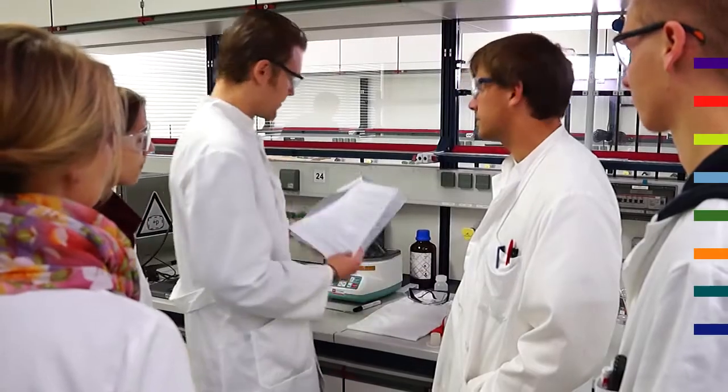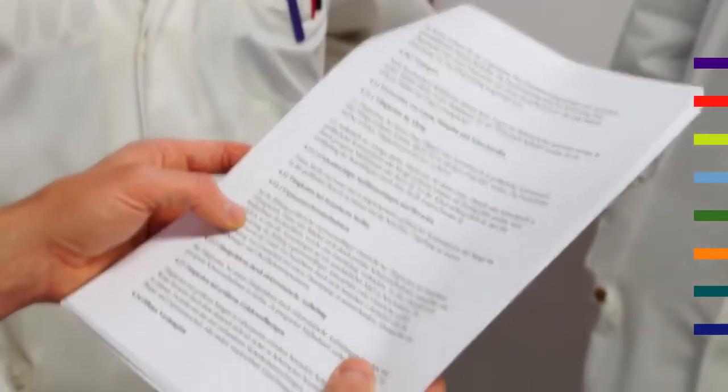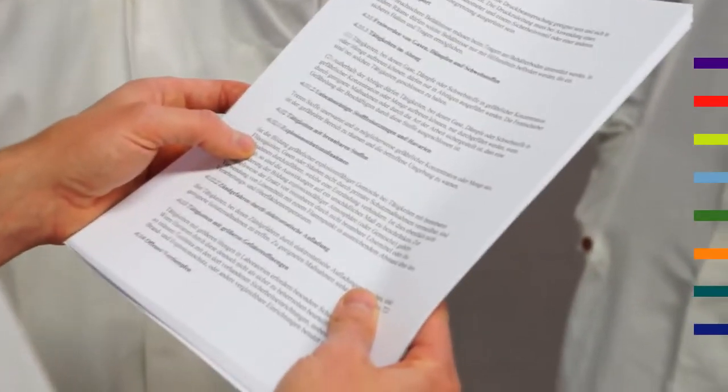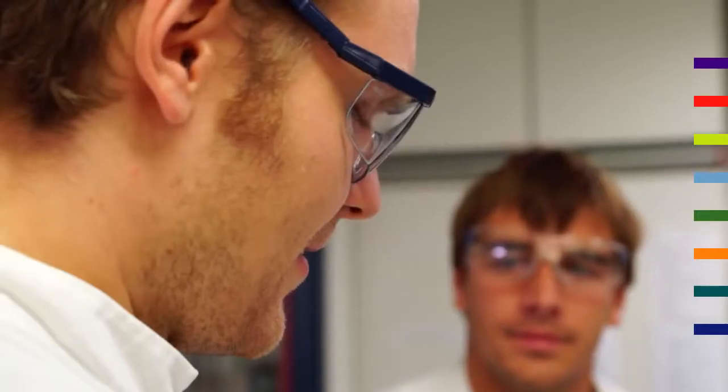Before work in the laboratory can begin, the laboratory supervisor presents an introduction of the techniques and laboratory equipment to be used. Furthermore, he will discuss personal protective bodywear, which includes safety specs and a lab coat. He makes you aware of emergency facilities.